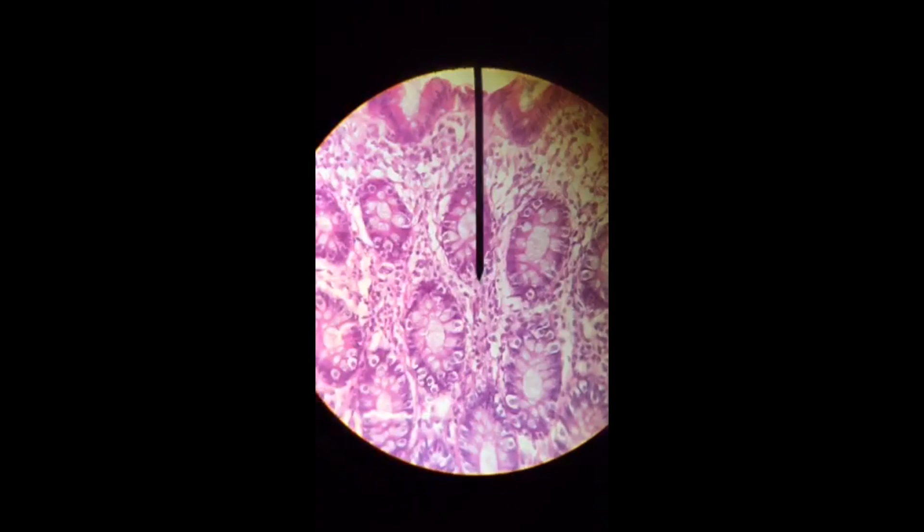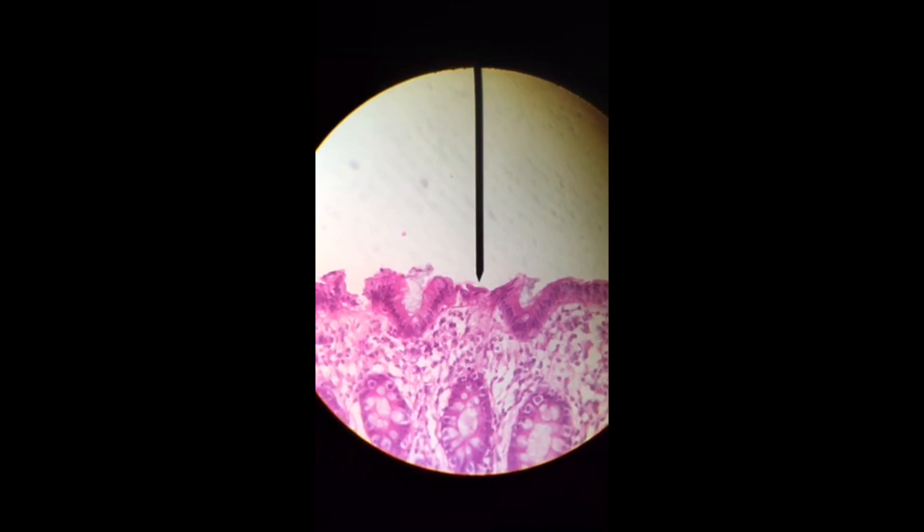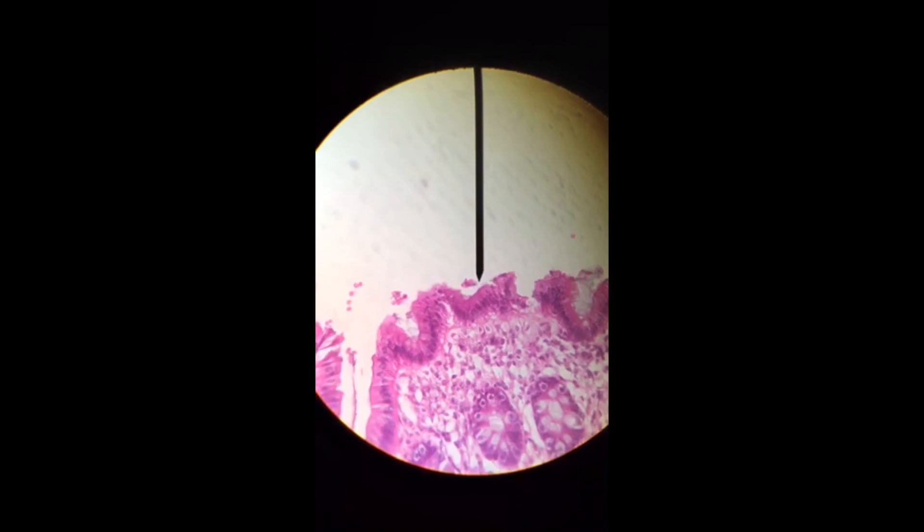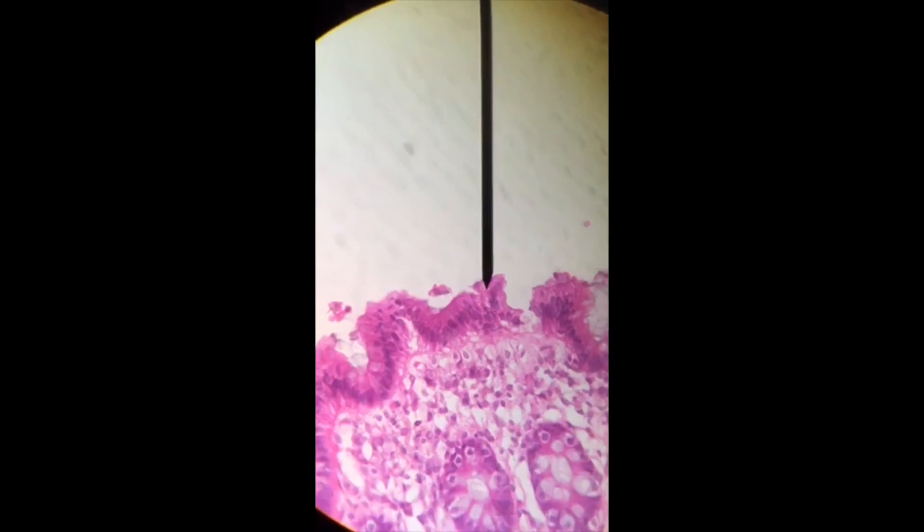Zoom on in, see those nice intestinal glands. We see our simple columnar arrangement of epithelium.